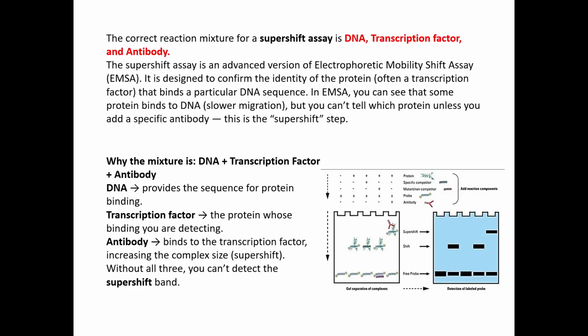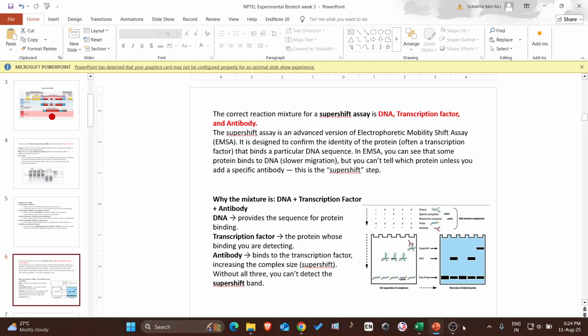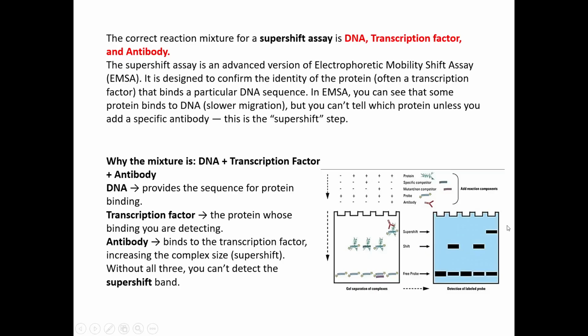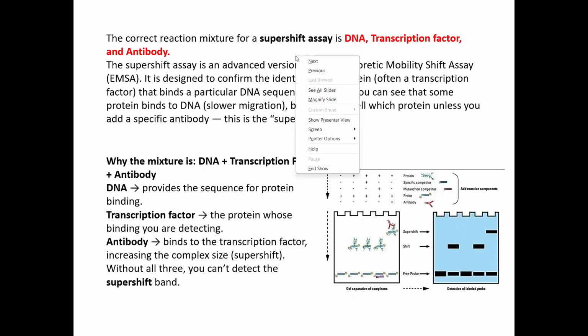The next topic is regarding the supershift assay. The correct reaction mixture for supershift assay is a mixture of DNA, transcription factor, and antibody.